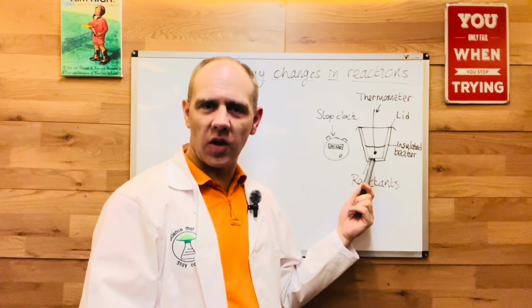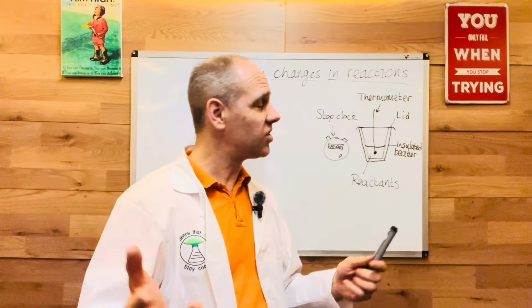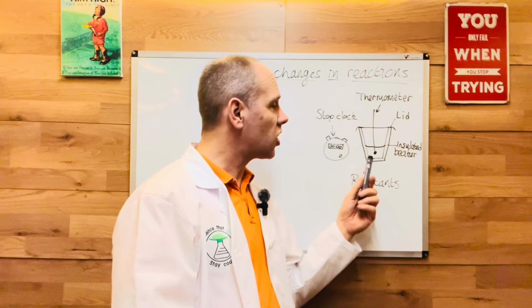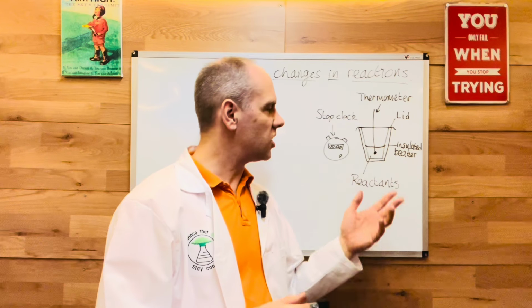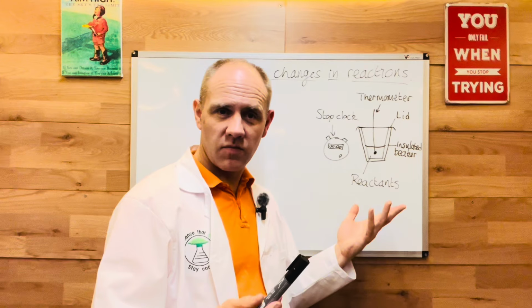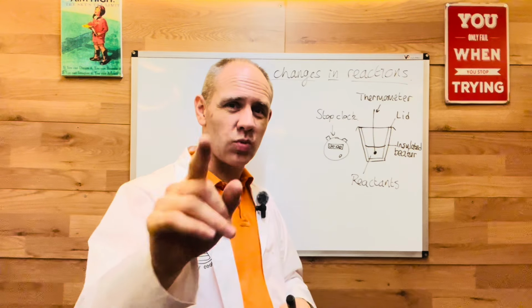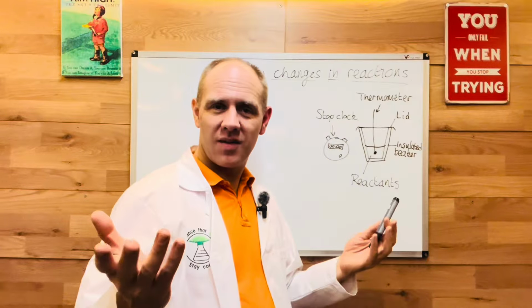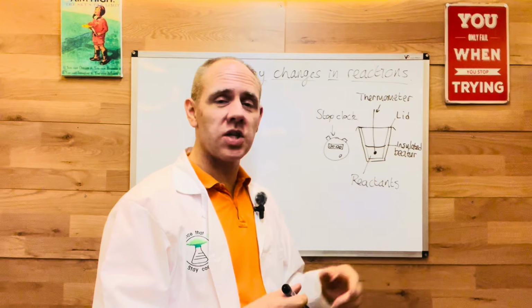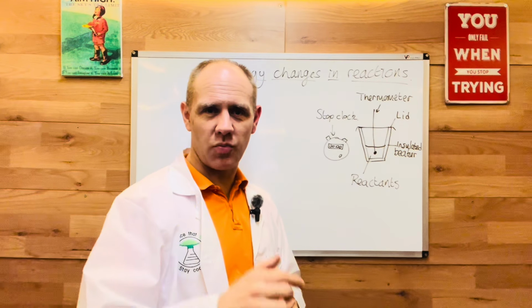So, the volume of the liquid, the mass of the solid, even the mass of the liquid, if you so desire, the concentration of the acid, the concentration of the dissolved substance. Voila. Those are things that you would keep the same, but one of those things is what you would change. What you are measuring is the temperature. Voila. Why would you use a thermometer? Well, it gives you good results, but what's even better than a thermometer is a temperature probe.